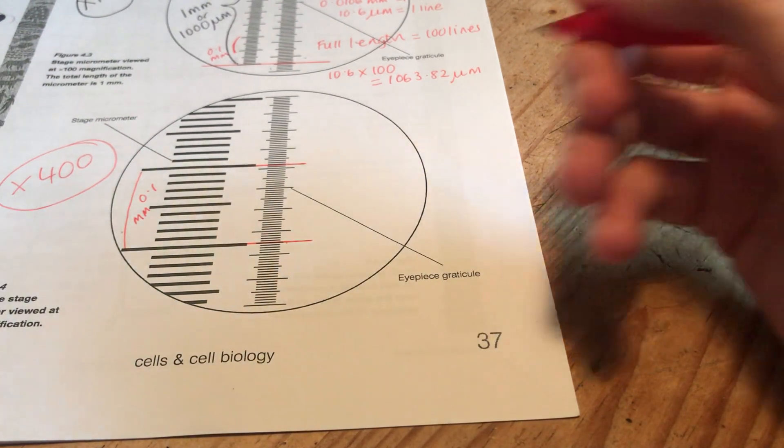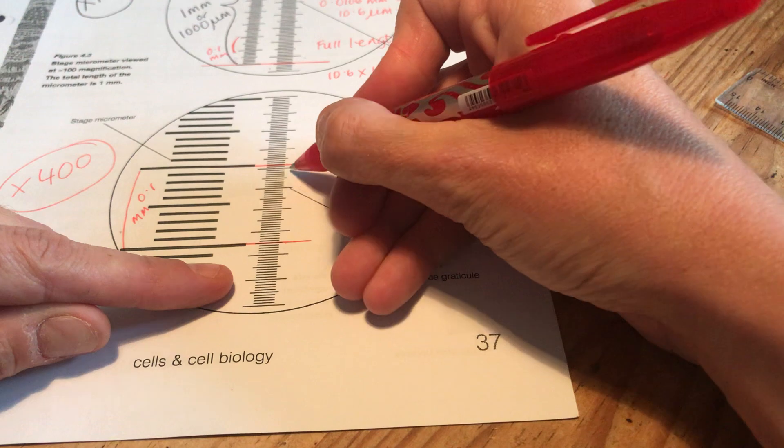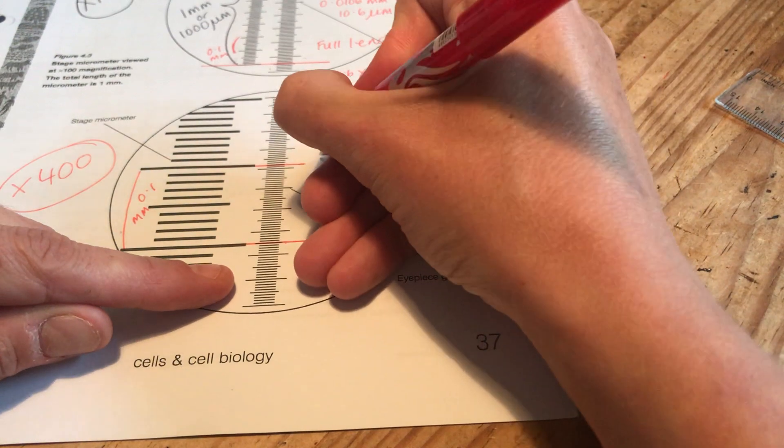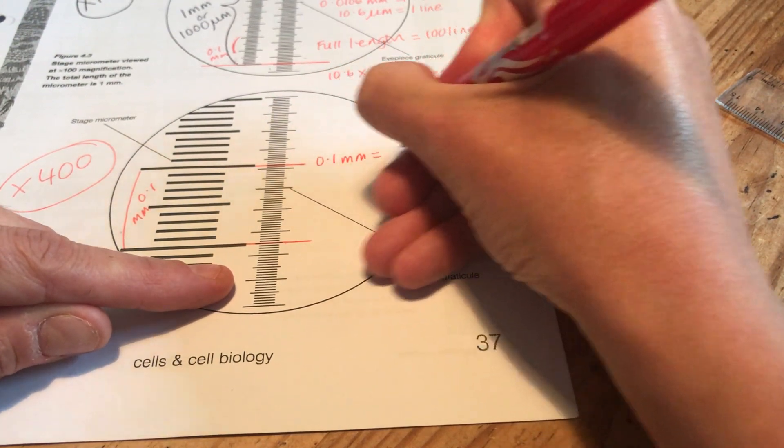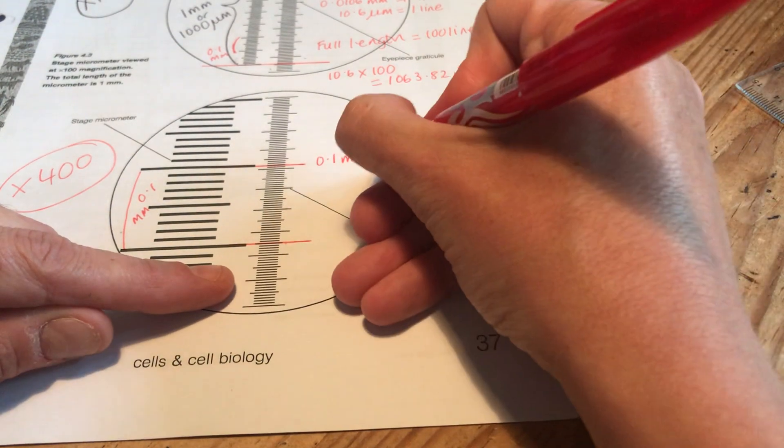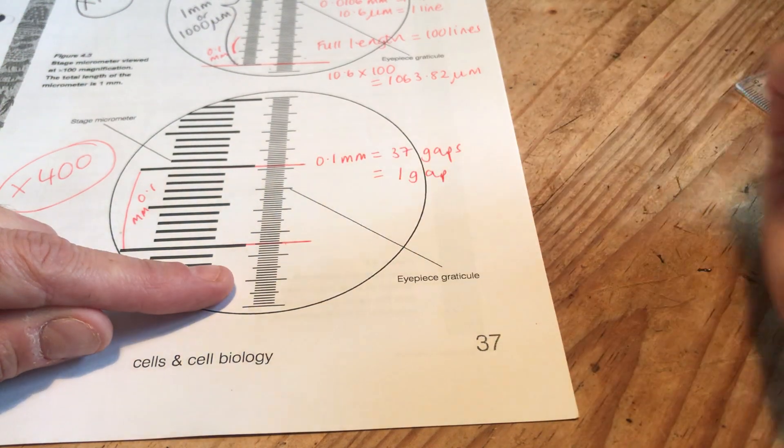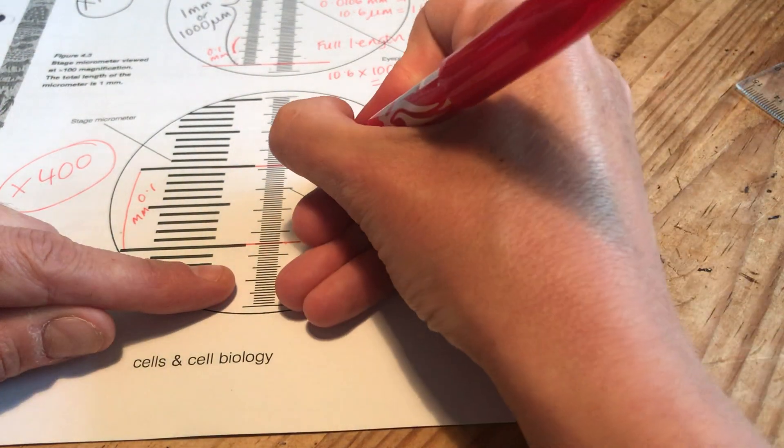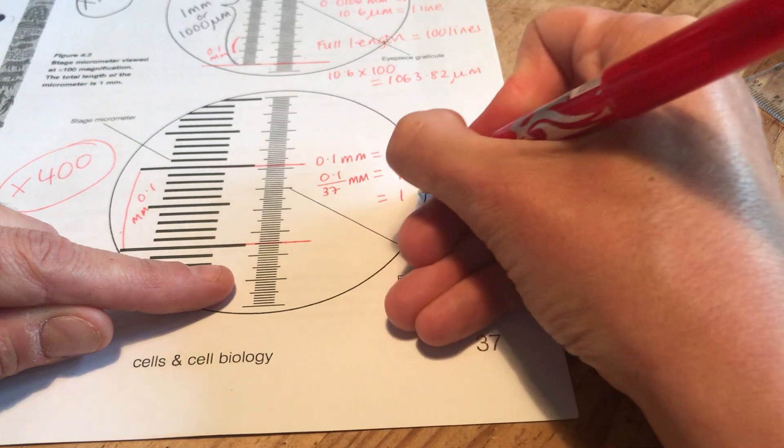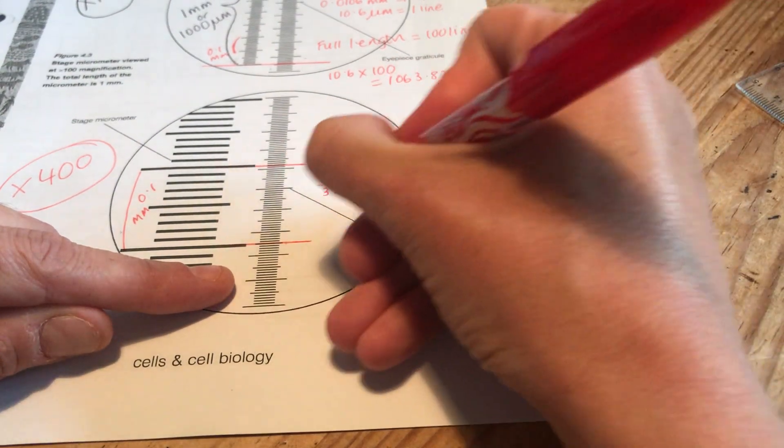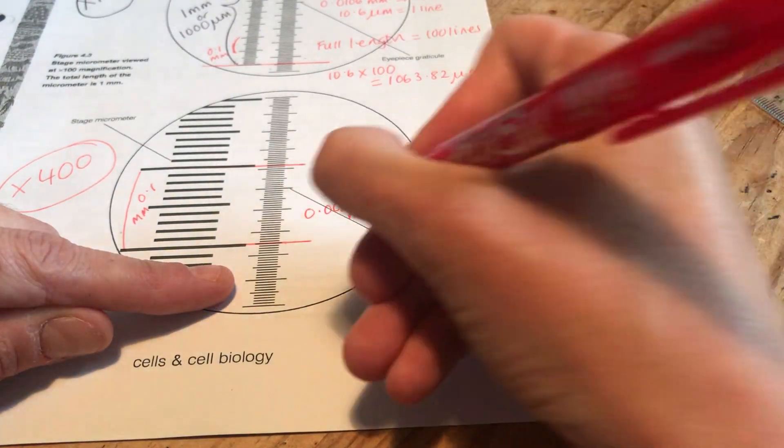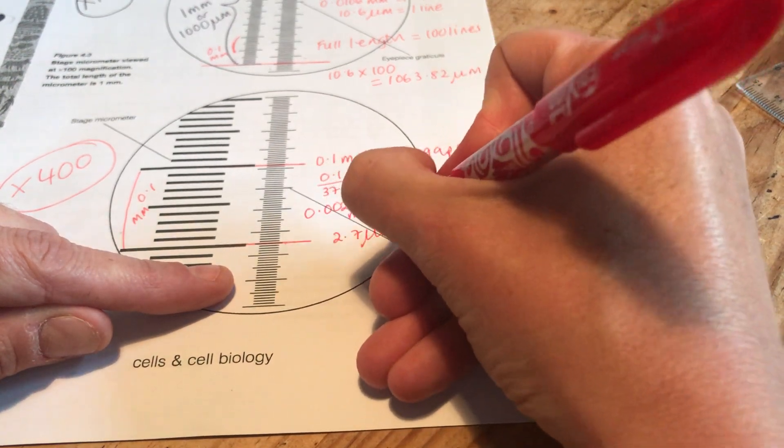And I'm going to count up how many gaps I've got here. So 10, 20, 30, 35, 36, 37. So 0.1 millimetres is 37 gaps on the eyepiece graticule. I want to know what one gap is worth at 400 times magnification. So I'm going to take 0.1 and split it up into 37 gaps and see what I get. So I'll do that and I'll find one gap is worth 0.0027 millimetres. Or if I tidy that up a little bit, 2.7 micrometres.